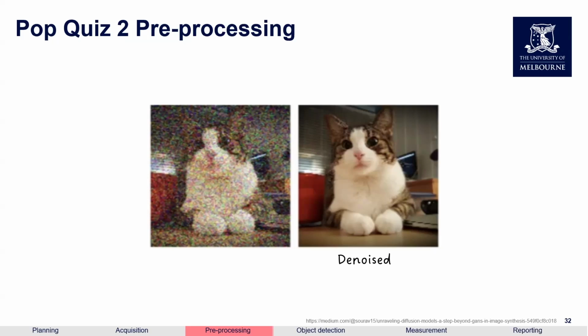I think most people have selected the right answer, which is good. The question was, which features can be improved during the pre-processing step? Where I've shown some of the image filters as well as the deconvolution method, it can improve the signal to noise ratio. Unfortunately, it cannot recover the saturated pixels. Once a pixel has been saturated, as I mentioned in the previous section, the information is completely gone. So that's why we have to be really careful in acquiring the right image to start with.